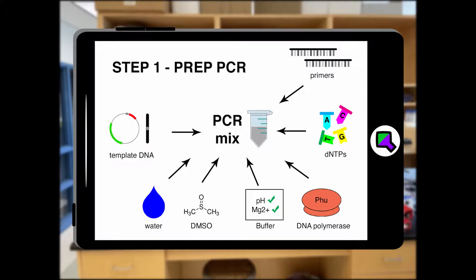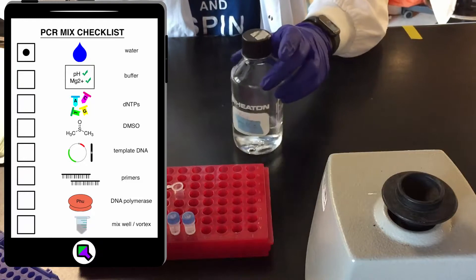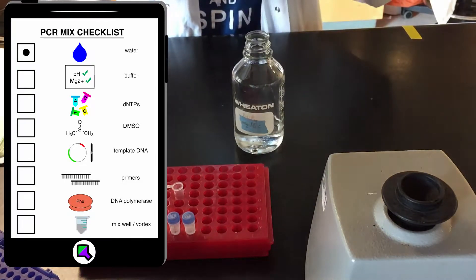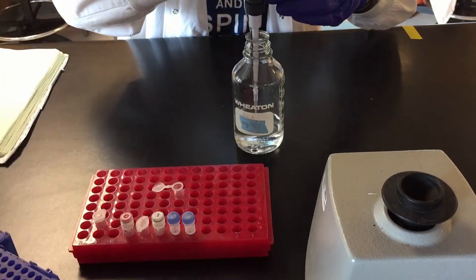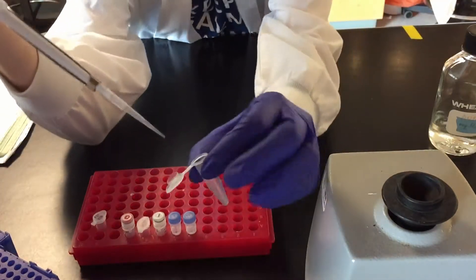Step one is preparing the PCR mix. First we add the water because it's the largest volume and it's easier to add other reagents to it. It also provides a space for the reaction to occur.